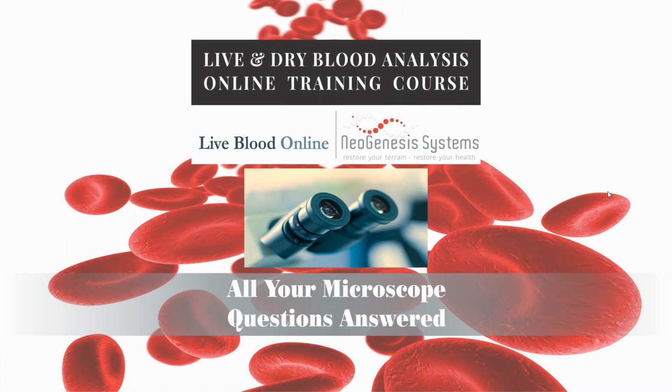The other challenge with phase contrast is that you need a dedicated phase contrast objective on the microscope. So your normal objectives that you use for Brightfield and Darkfield won't work for phase contrast. You would basically need to decide which type of objective, what magnification you'd like to have for phase contrast, and then one of the other objectives that you have on the microscope would have to be replaced with a phase contrast objective.